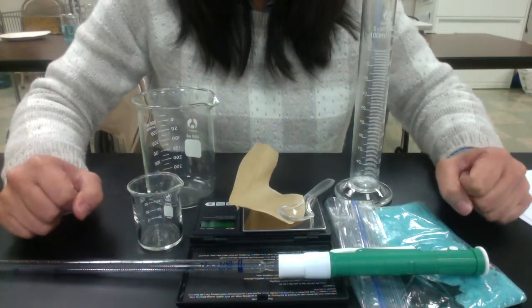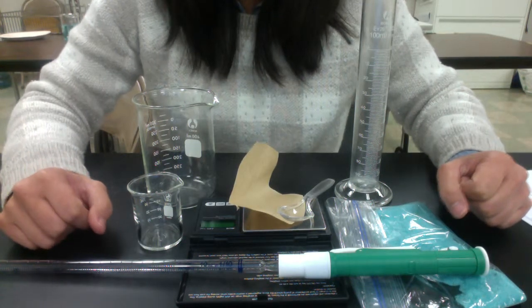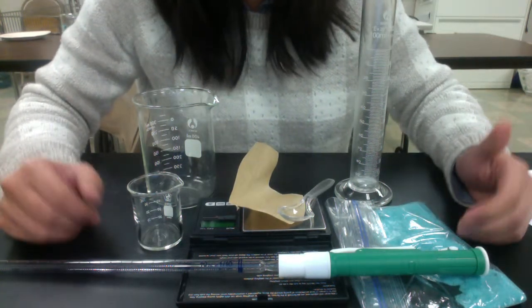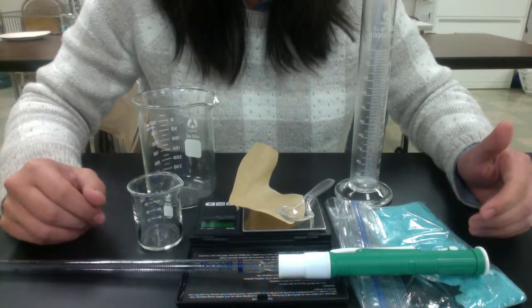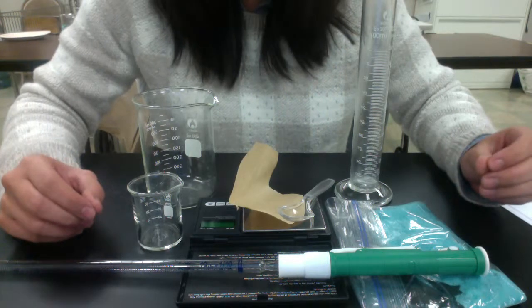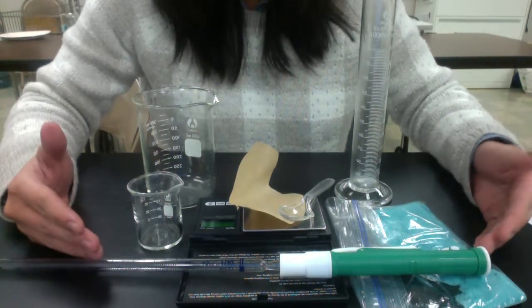These are the instructions for Concentration and Molarity Lab Part 1. In Part 1, you have a patient and you have to make IV fluids for them in the right concentration. So there are a couple of things you need.